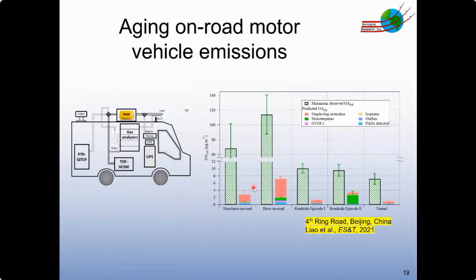And you wouldn't necessarily know this until you made the measurement in situ, and that's where OFRs can provide significant value compared to chambers, which you can't take into the field to measure in the same way.